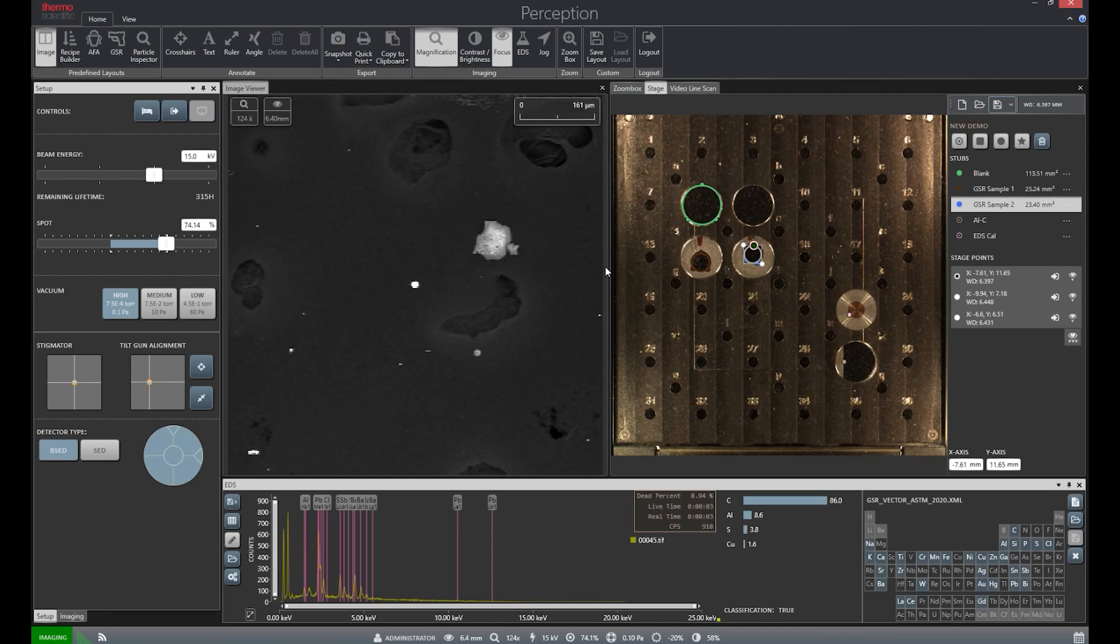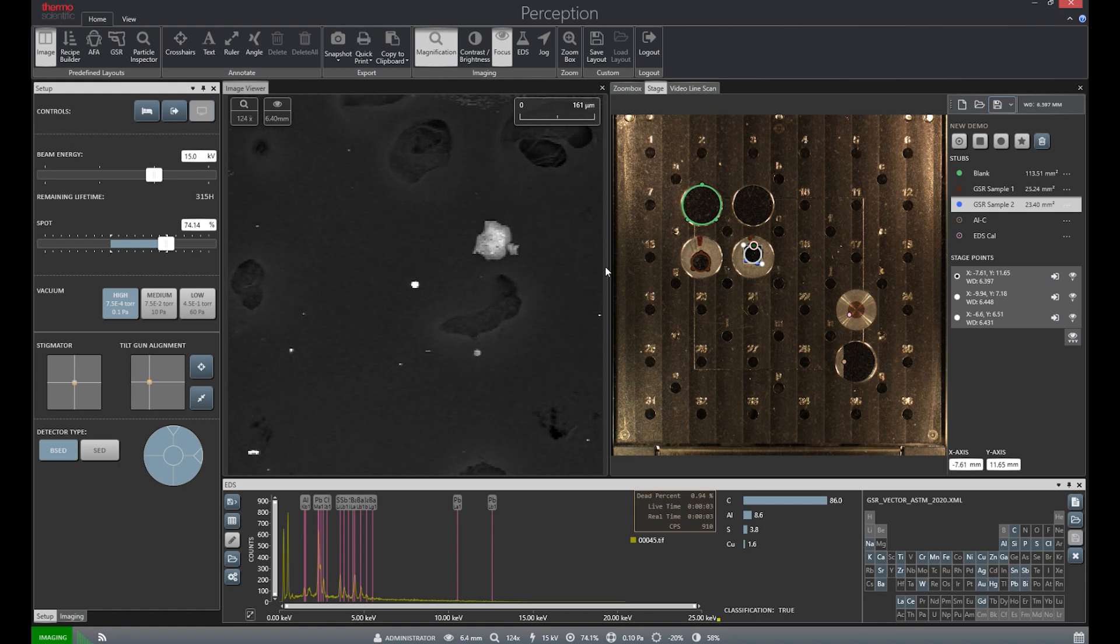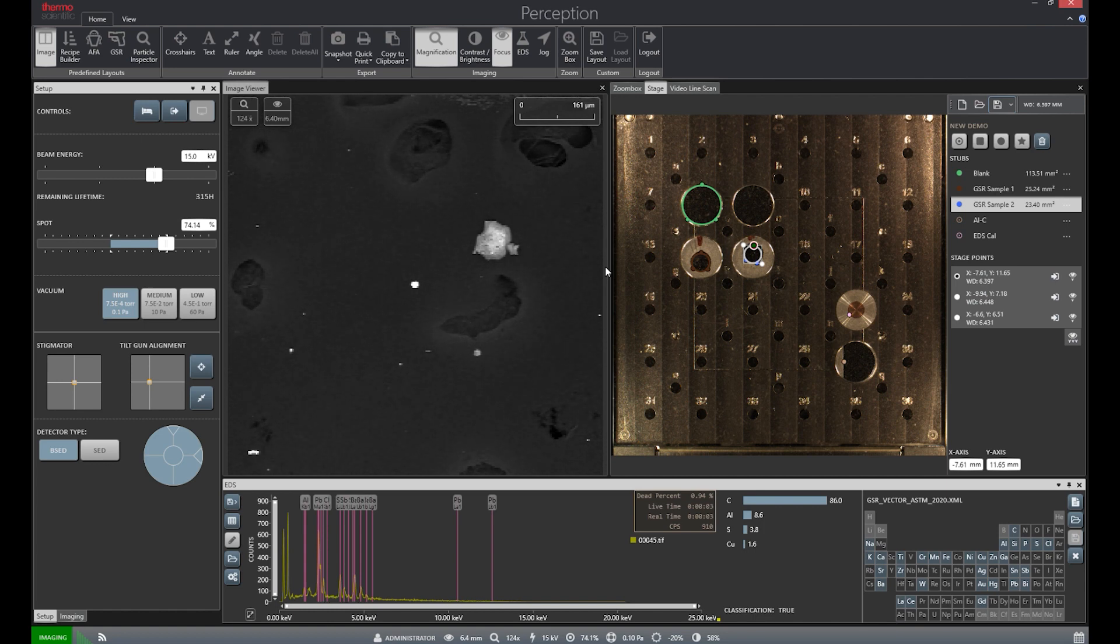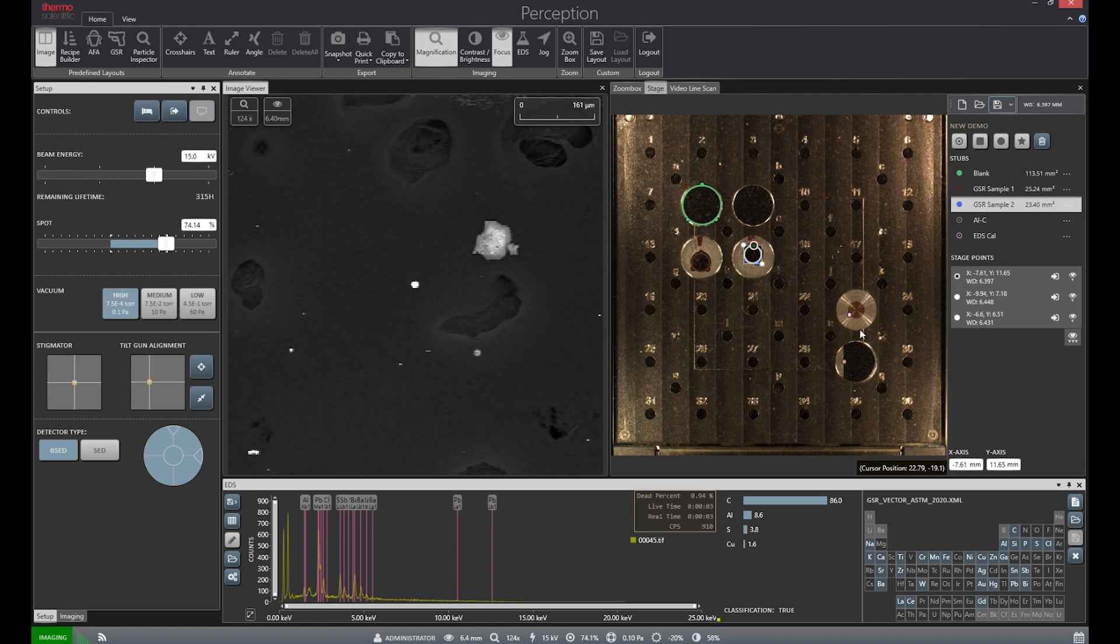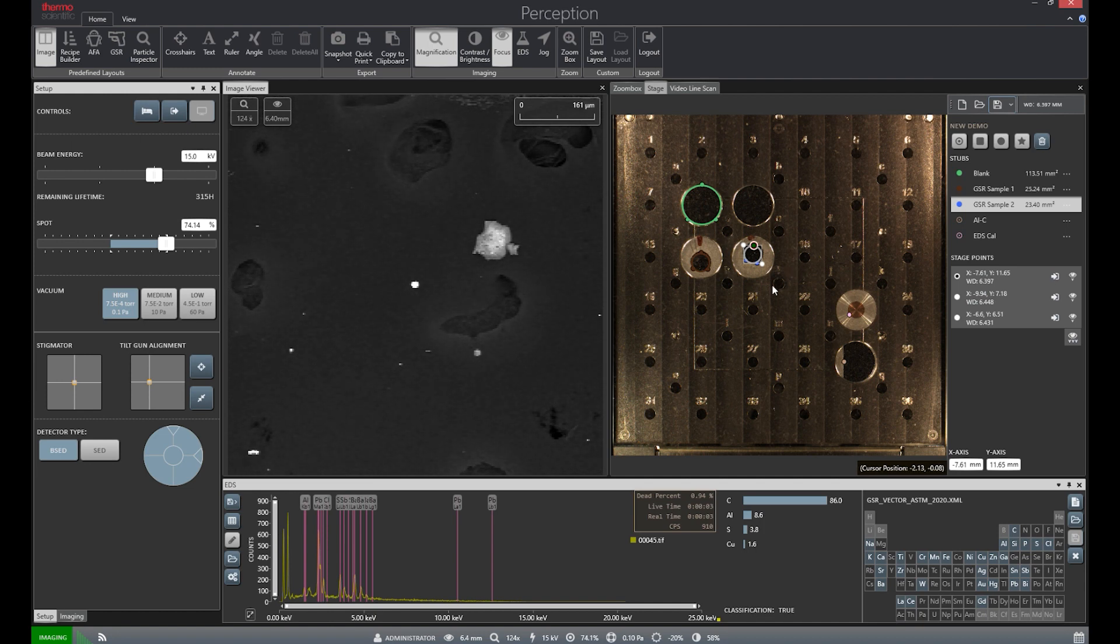We begin our GSR run by opening up the Perception software on our PhenomXL. This is the standard view of the software and what you'll see when opening up Perception. When the software loads the holder into the chamber, a separate camera, called a navigation camera, takes a picture of the sample holder. This image will be displayed on the right and allow us to create our stage file.